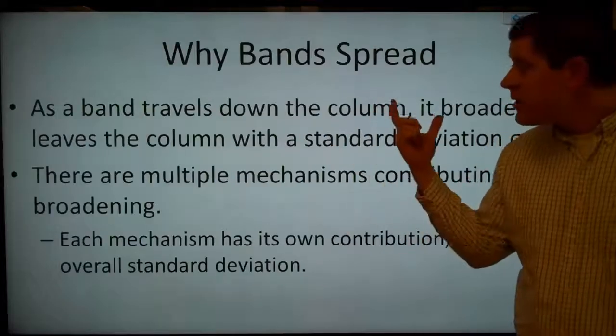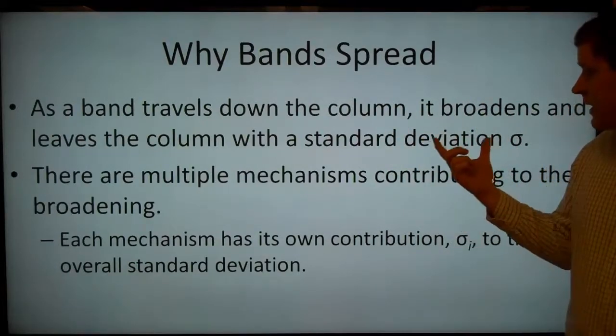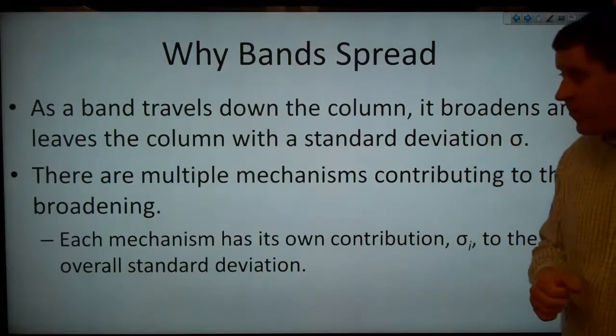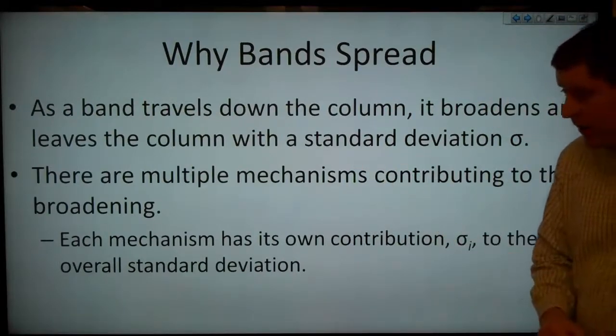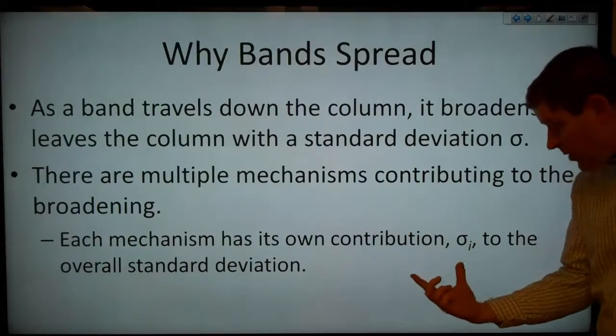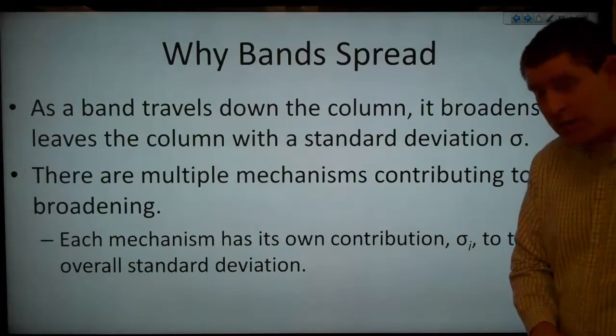So as a band travels down the column, it broadens and leaves the column with a standard deviation of sigma. And there are multiple mechanisms contributing to this broadening. Each mechanism has its own contribution, sigma sub i, to the overall standard deviation.